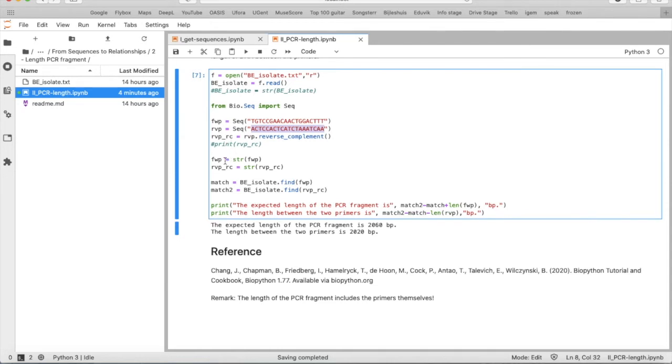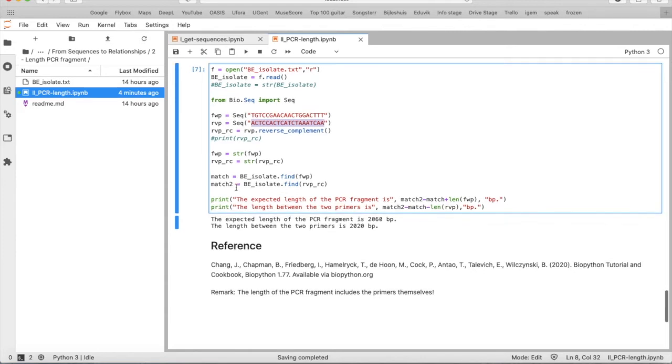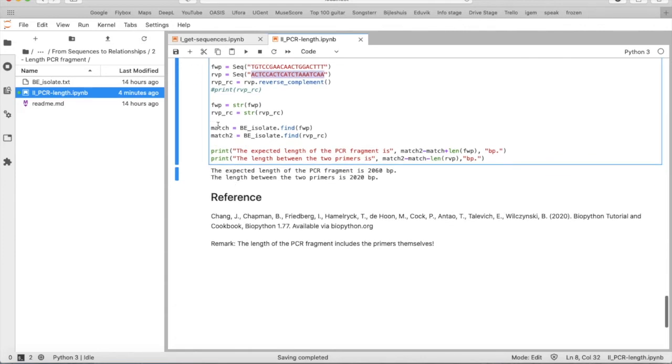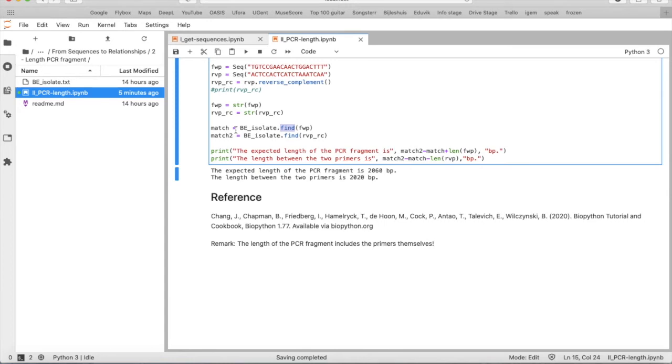We convert both primer sequences to a string. And then we will search for the location of both primers using the find function. So we say match is BEIsolate.find and then the forward primers sequence. And match 2, the same, but for the reverse complement of the reverse primer.